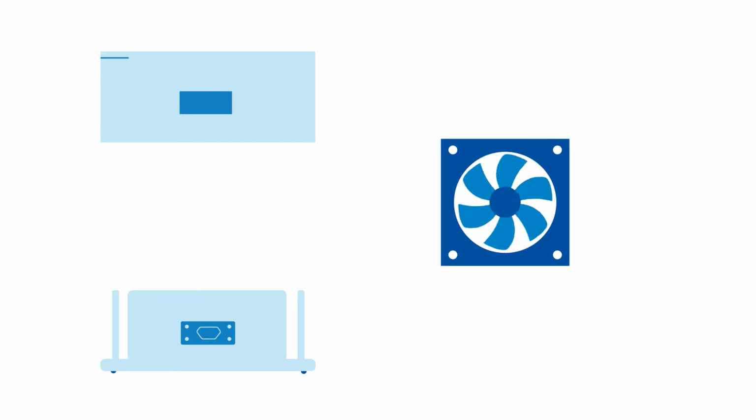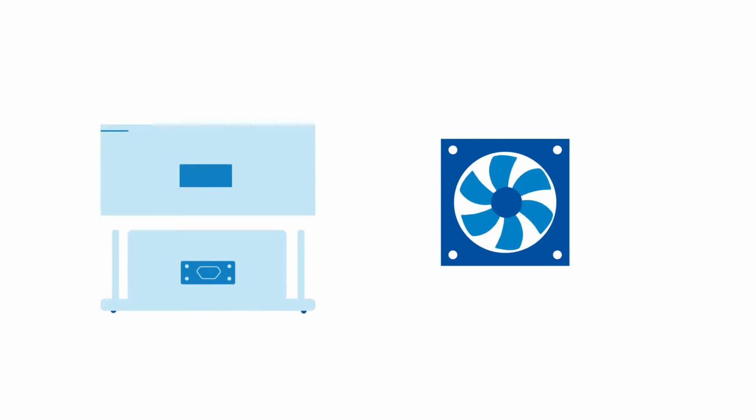Before a new instrument is developed, the research and development team evaluates all of the components for serviceability. There are parts that could theoretically last forever, like a circuit board, but there are also parts that we know will only last for a certain amount of time. That information usually comes from our part vendors or from historical experience and data.